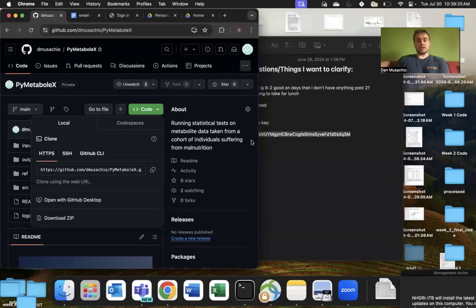Hello all. This is a little demo of the PyMetaBolex software.